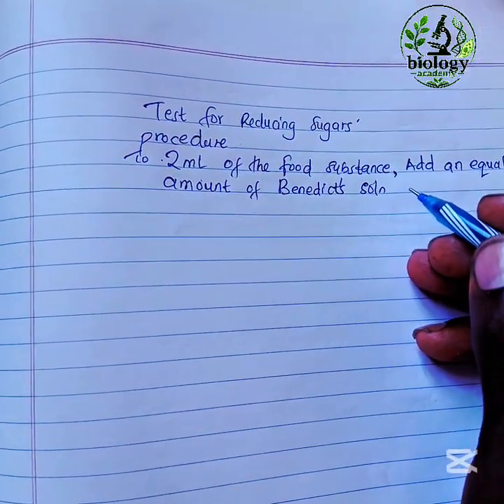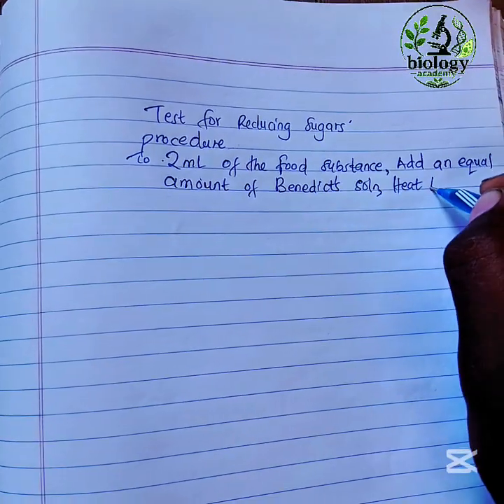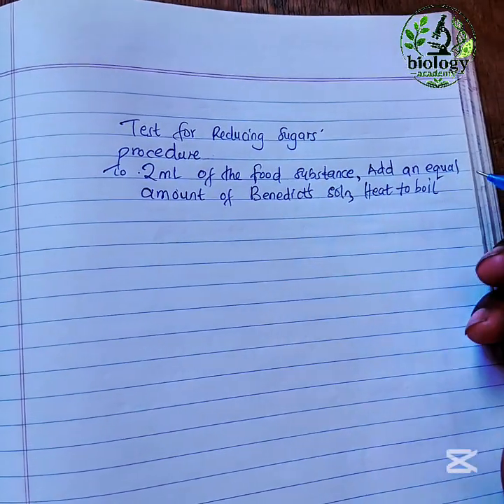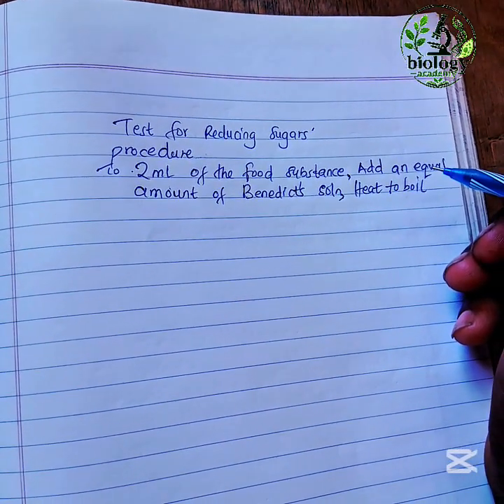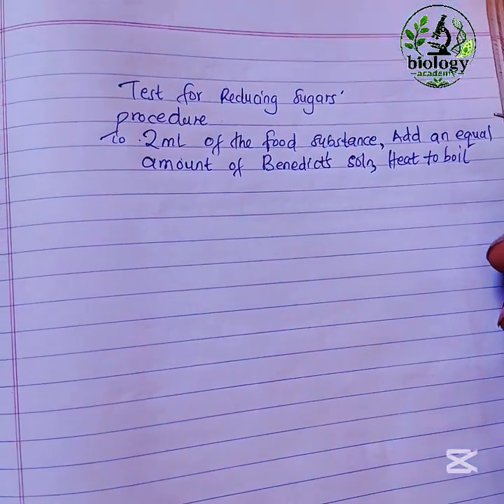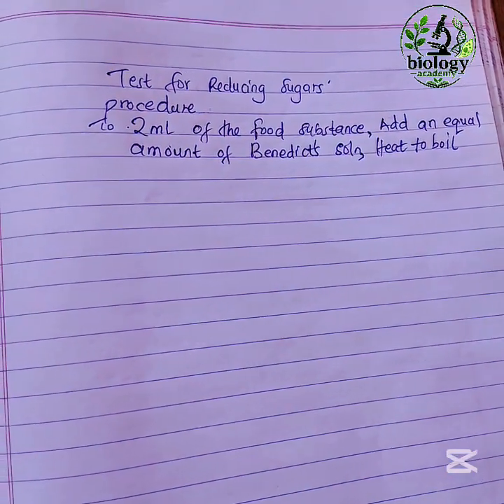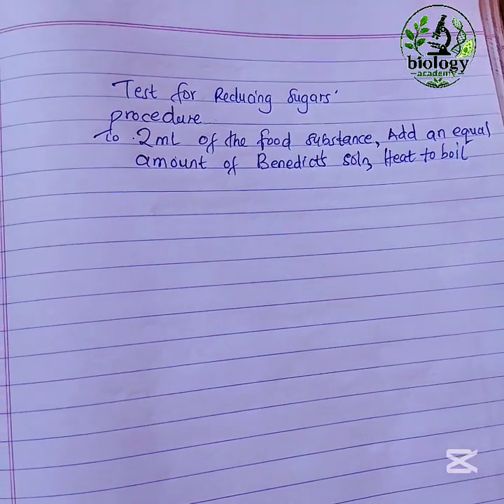After adding an equal amount of Benedict's solution, heat to boil. So the mixture of the food substance and Benedict's solution, you heat it to boil. Some people might heat, but don't leave it to boil, so the color will not change to the maximum.